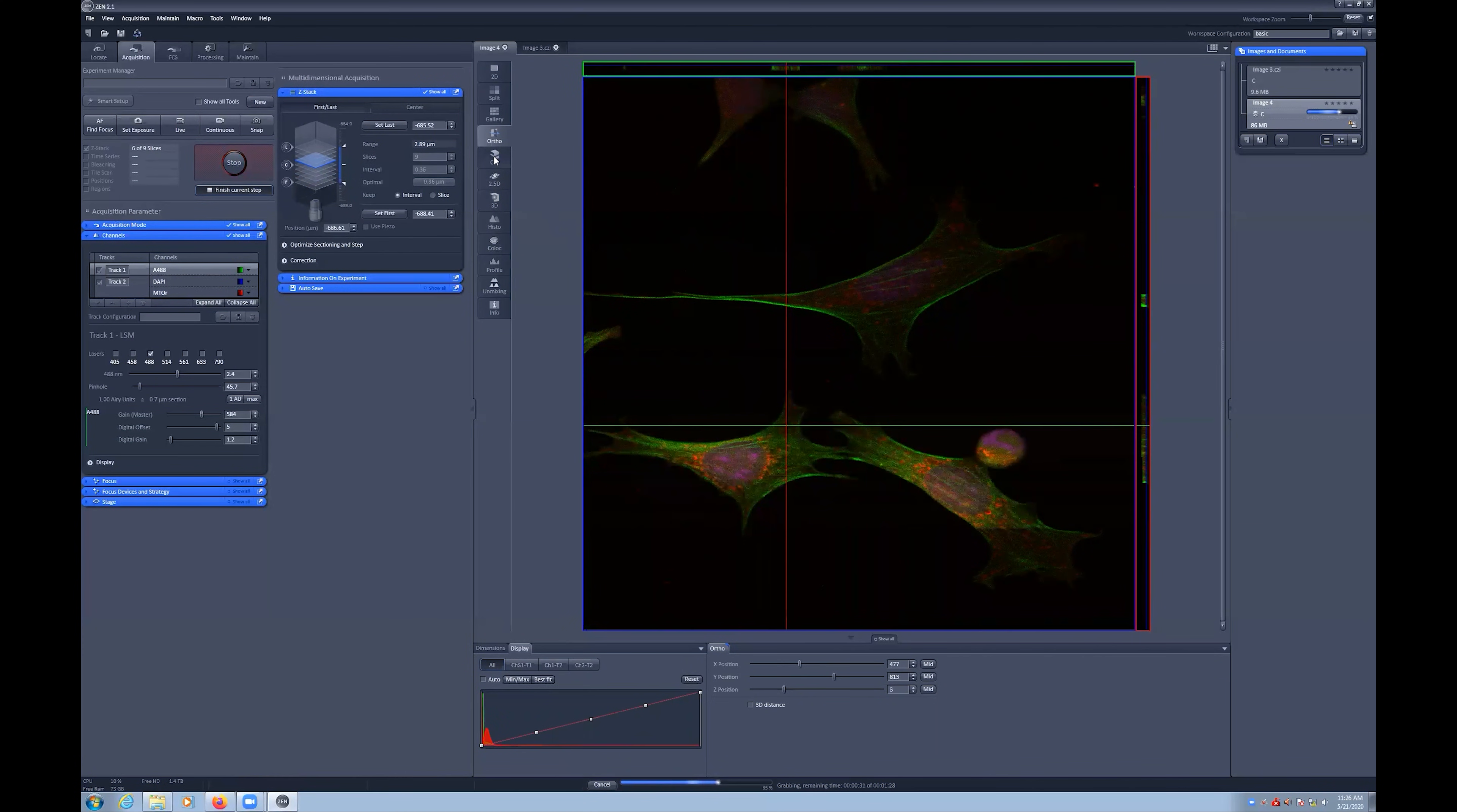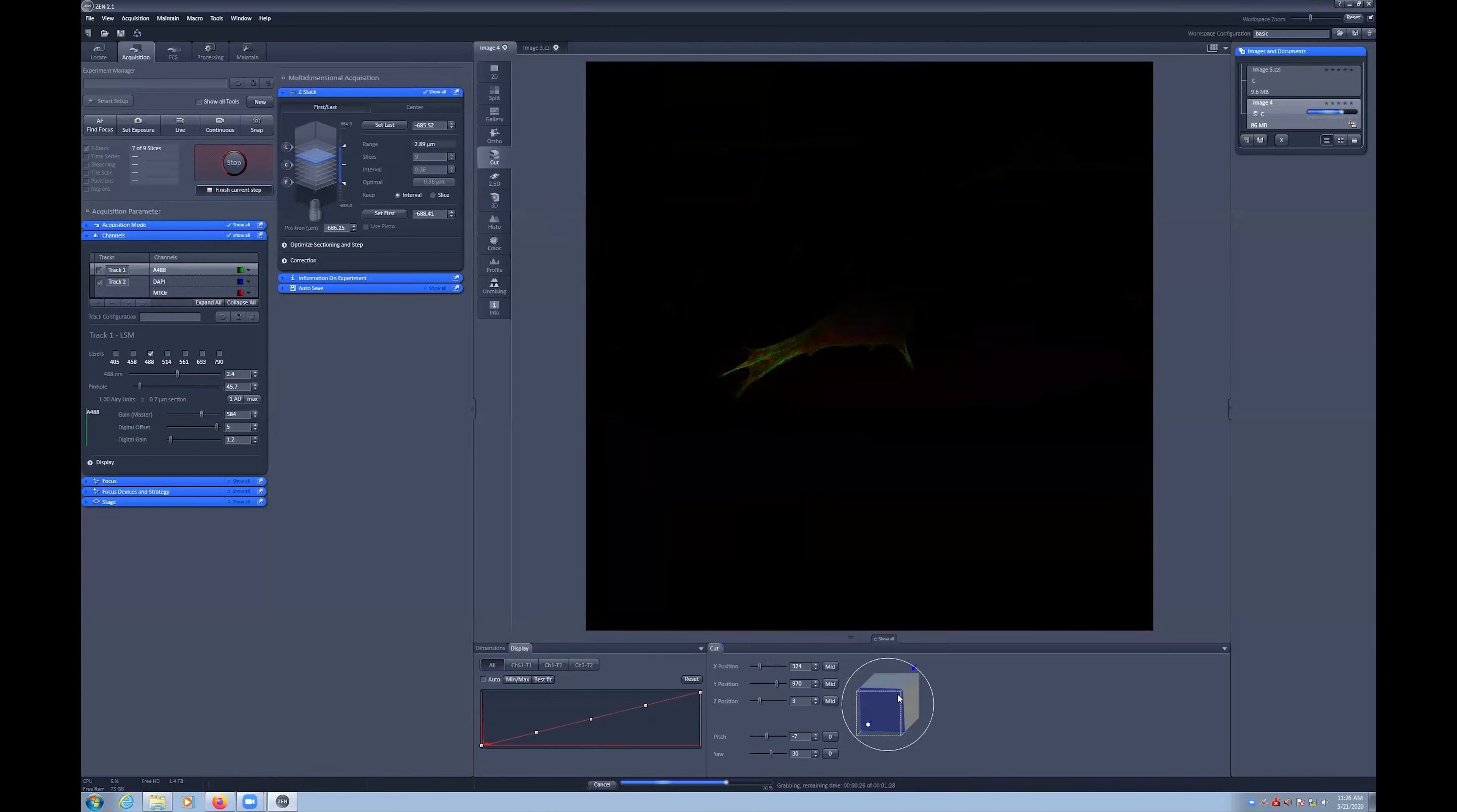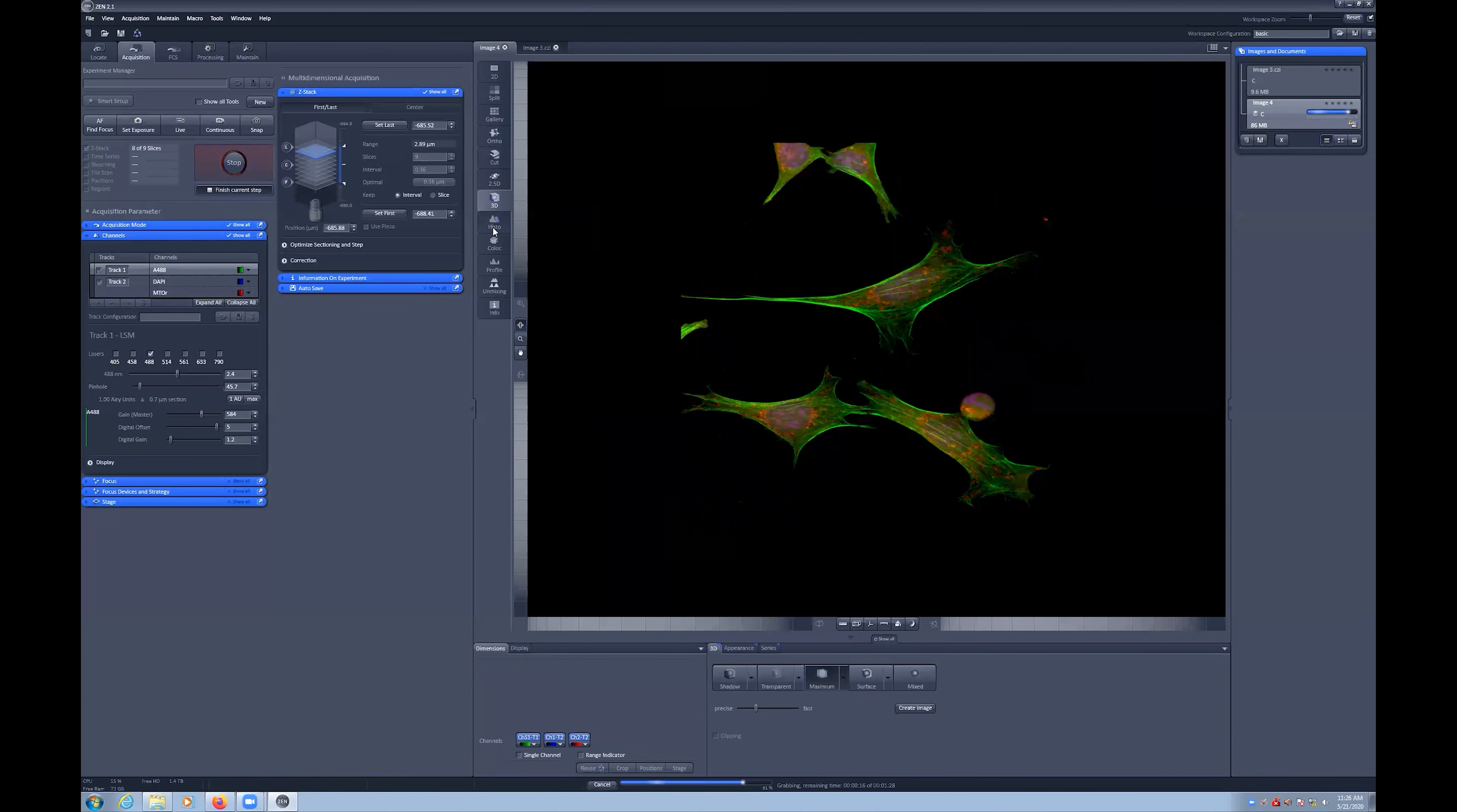The Cut view allows for 3D reslicing of your dataset, while the 3D viewer lets you explore and rotate the data in 3 dimensions.